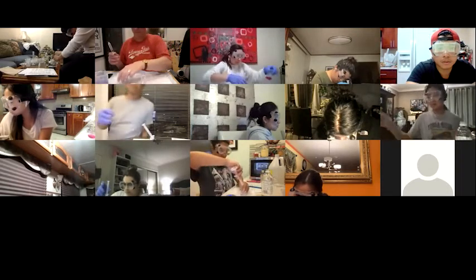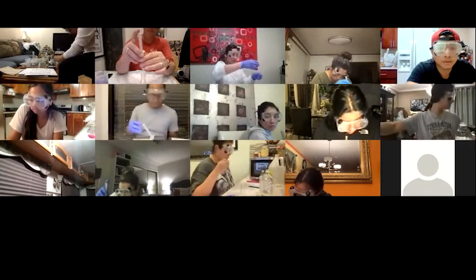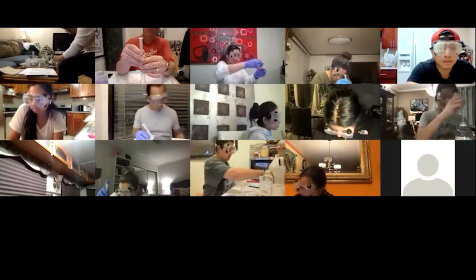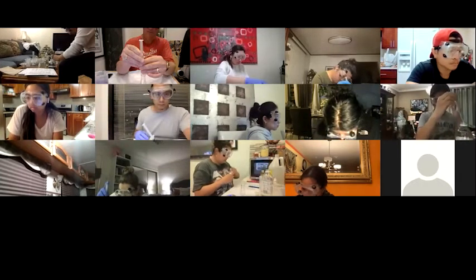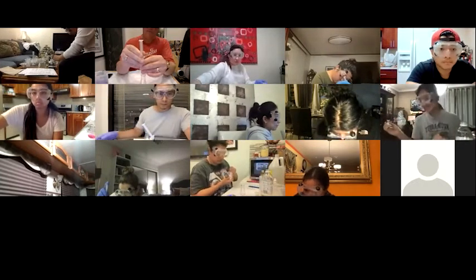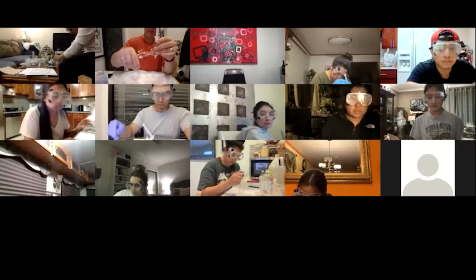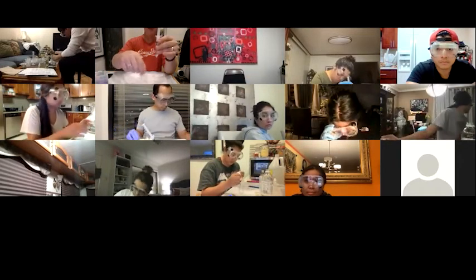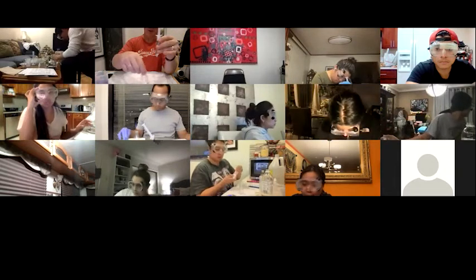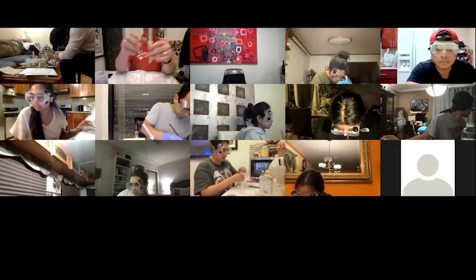All right. Let's try that again. All right, looks better already. I'm not getting any blue or green color. Yeah, so let that be a lesson. Make sure you've washed out the flask.